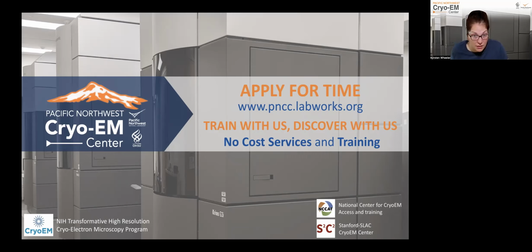As I said, we've got a Glacios this year, which is being installed right now. It's almost ready for users. However, PNCC has 6 microscopes.